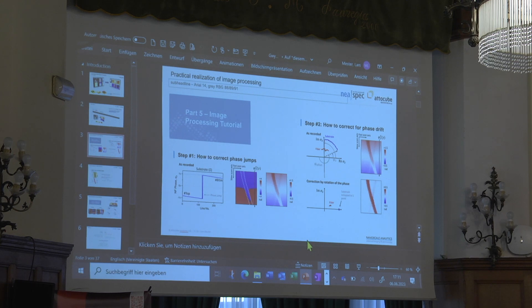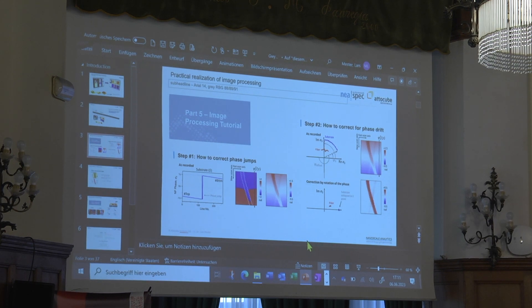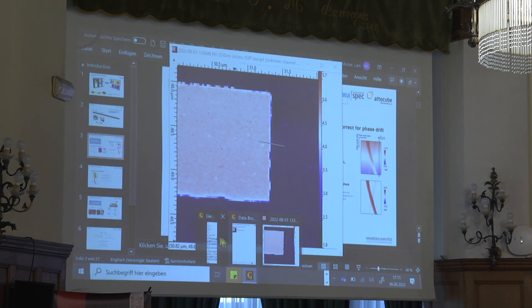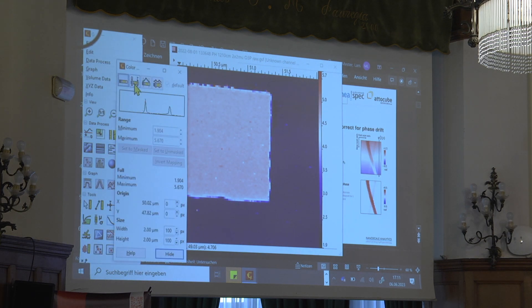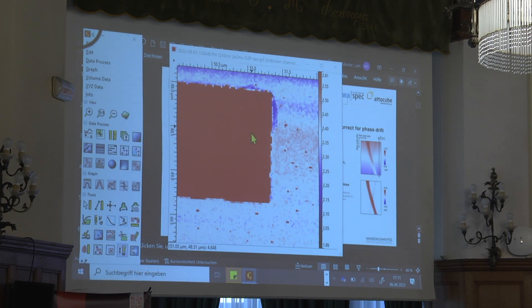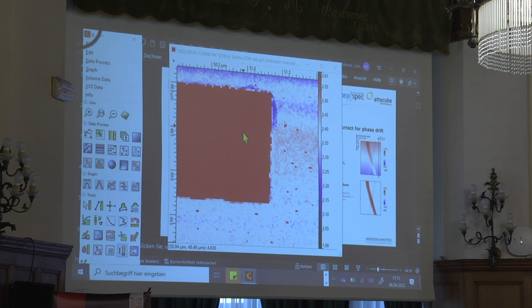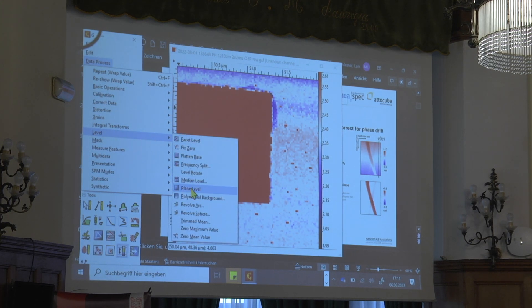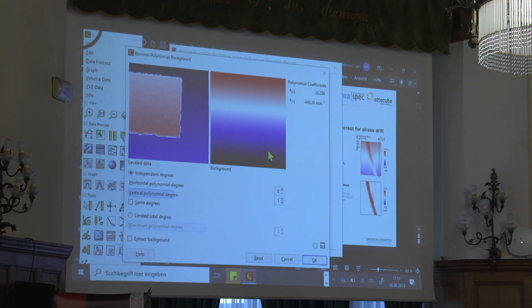This is how to correct for phase drift. In this image there's not really a strong drift, but if we zoom in to the substrate we can see it's not homogeneous. What we can do — and I realized in the webinar it's not done in an ideal way — you can just remove a background from this image. I want to remove just a plane in the vertical direction, the slow scanning axis, and this is done with two mouse clicks.